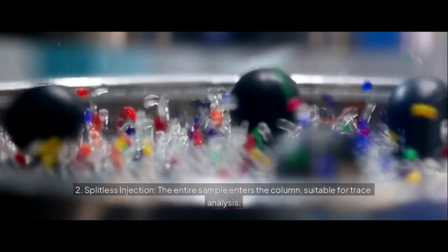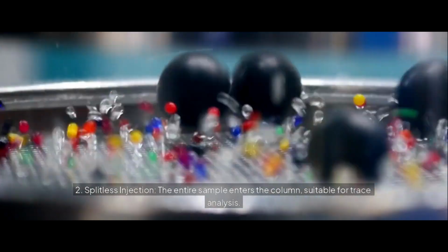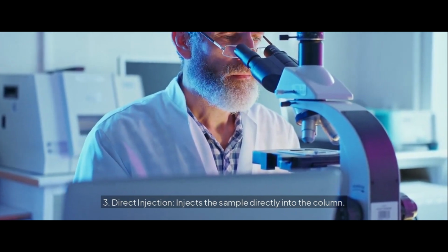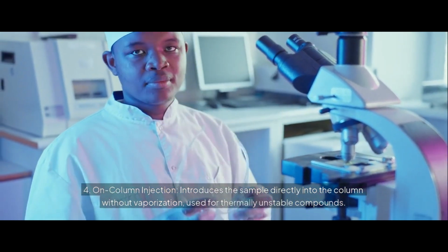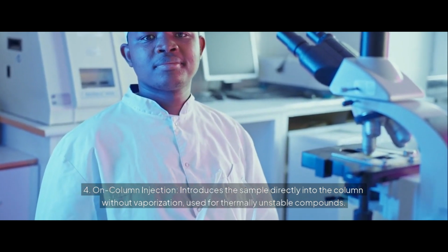2. Splitless injection, the entire sample enters the column, suitable for trace analysis. 3. Direct injection, injects the sample directly into the column. 4. On-column injection, introduces the sample directly into the column without vaporization, used for thermally unstable compounds.